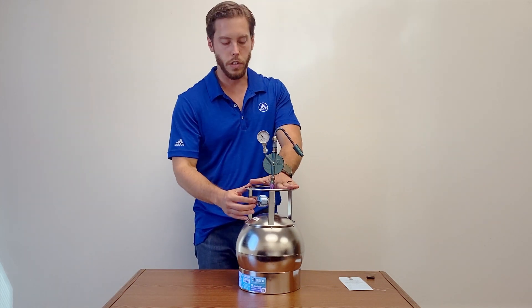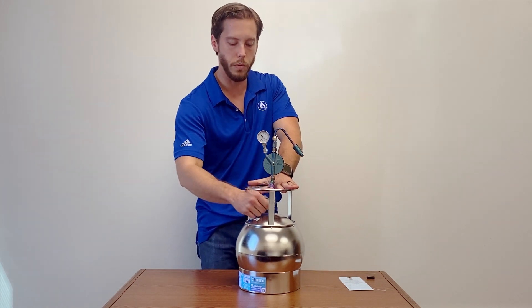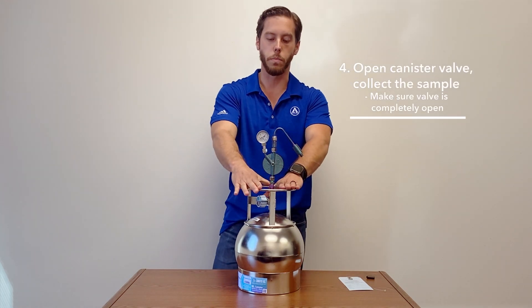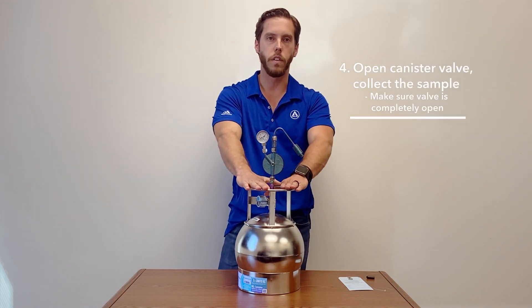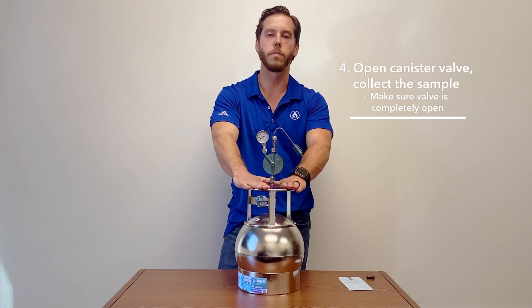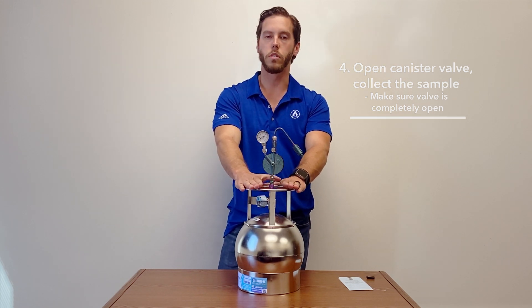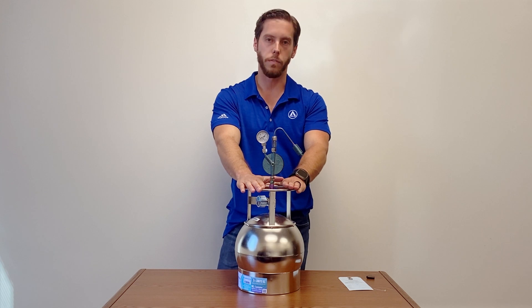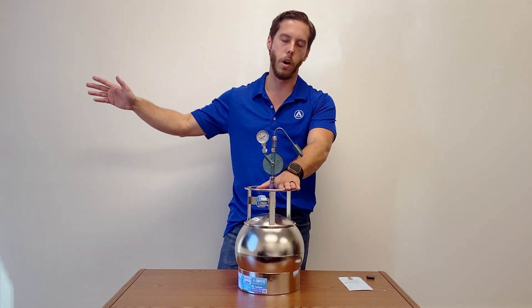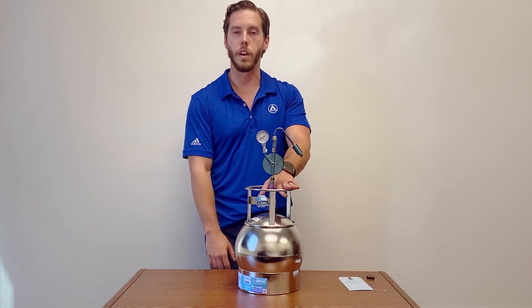The canister's not open yet so it's not collecting the sample. Once you're ready, you can open the canister and then you're ready for sampling — it's pulling right now, so you can move it to wherever you want. Just make sure that when you leave the canister the valve is completely open. If you're running for 24 hours, if you start today at 2 p.m., come back tomorrow at 2 p.m. and close off the canister.